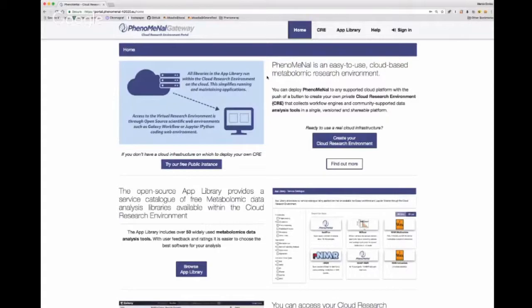If you notice on top, at the top right of the portal website, you can see a little sign-in link, which indicates that the user is unauthenticated, and so all this content is accessible by anyone.